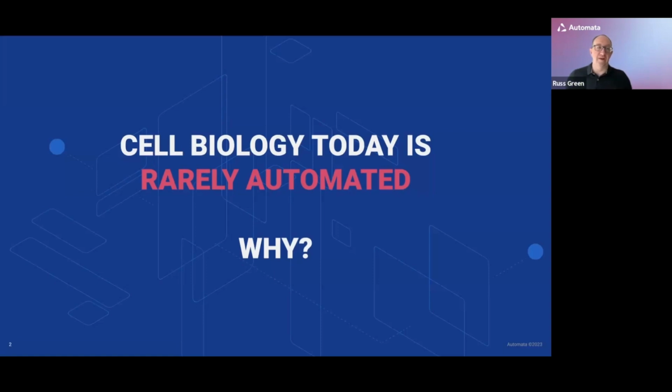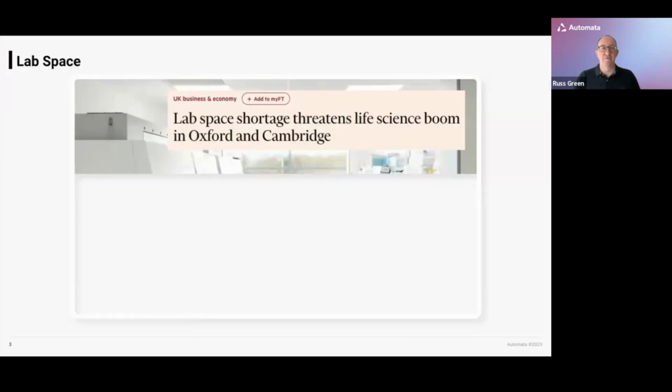For the stage we're at in terms of standardization of experimentation around tissue culture-based experimentation, there really isn't as much as we think we should see in that space. And I've got a few questions about why that might be. First of all, I want to think about some general questions, and then I'm going to go into some specific things about why this might be particularly challenging for tissue culture itself.